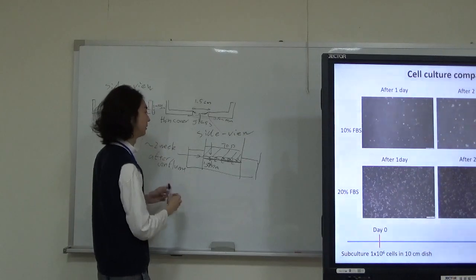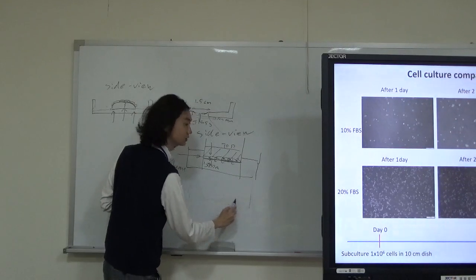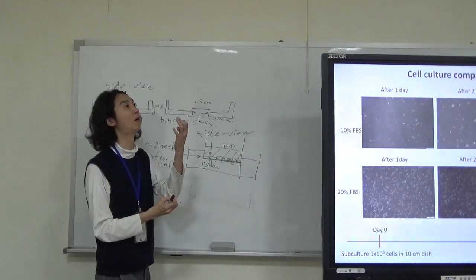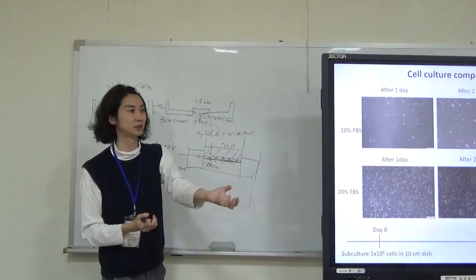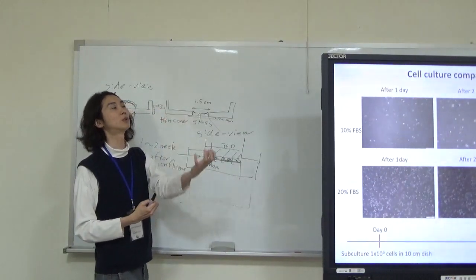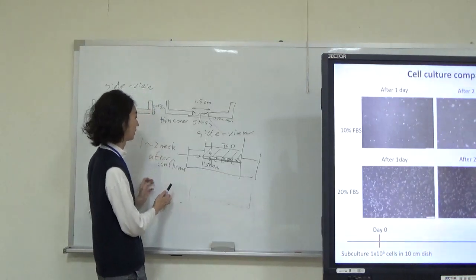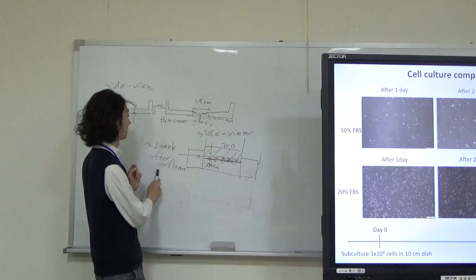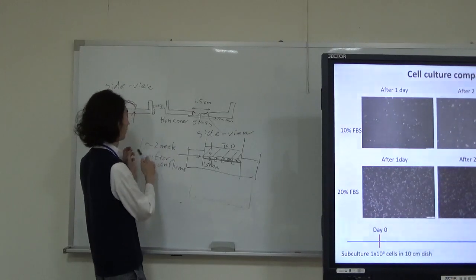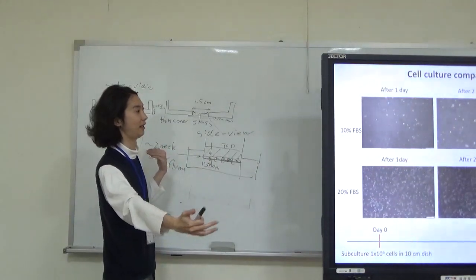So even in the plastic bottom dish, if you want the proliferation effects of a natural product or drug on proliferation, you treat before confluence. But for other effects like toxicity, or blocking inflammation induced by H2O2 or some oxidant, you should use cells cultured for 1 or 2 weeks after confluence, so that needs a longer time before treatment with the compounds.